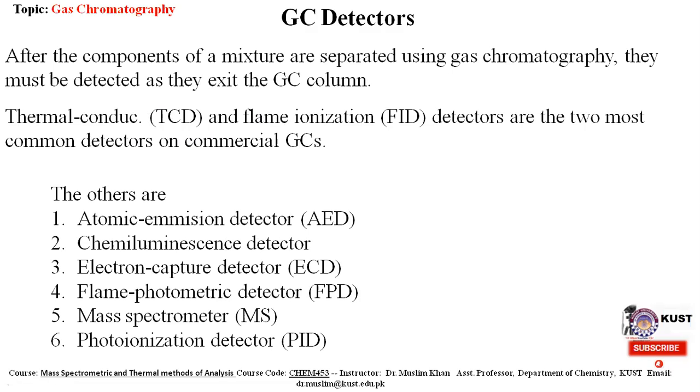The other detectors include atomic emission detector, AED, chemiluminescence detector, electron capture detector, ECD, flame photometric detector, FPD, mass spectrometric detector, and photoionization detector.